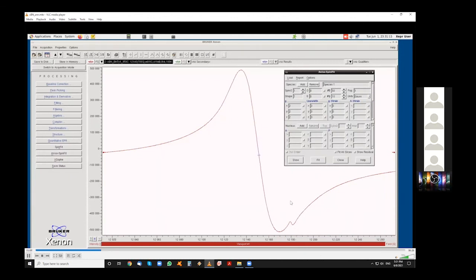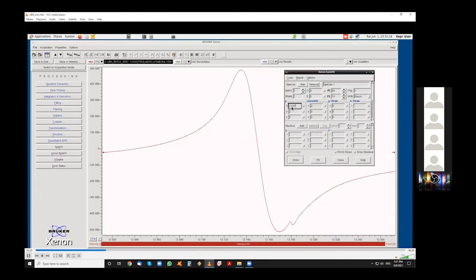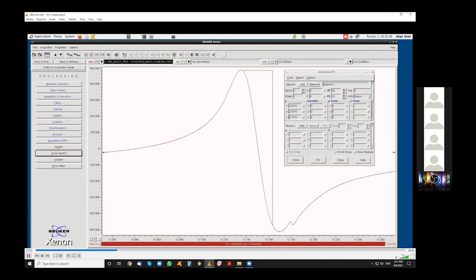You will observe here that the intensity of the line is less than before. So this is telling us that our defect in this case is less stable than the other one. So using the annealing treatment, we may check the stability of the defects and we can distinguish between defects.